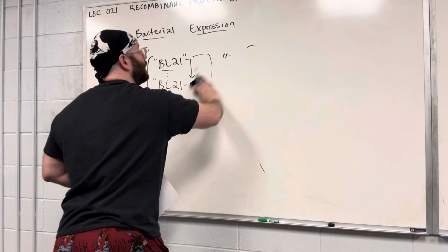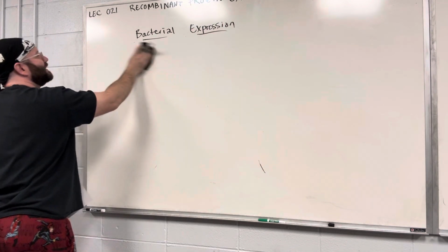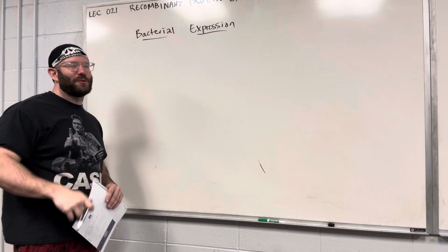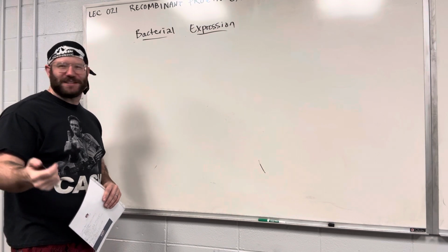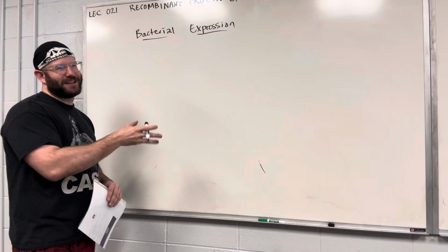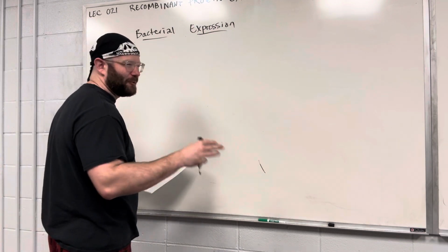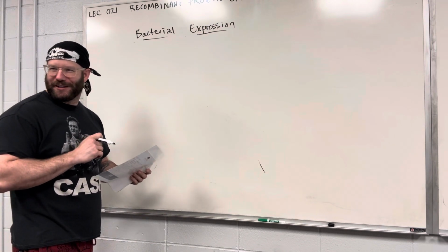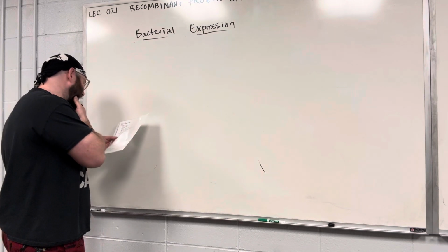What does the BL stand for? I don't know, you'd have to Google that. I know the Rosetta is like, the plasmid is the Rosetta Stone, right? That's probably why they named it. Yeah, that's clever, I don't actually know if that's true. That makes sense, that the Rosetta Stone is translating, and so that would connect the tRNAs to translating rare codons. Yeah, that makes sense. But I don't know what the BL21 comes from. Probably some boring methodology, like this was BL version 21, I don't know.